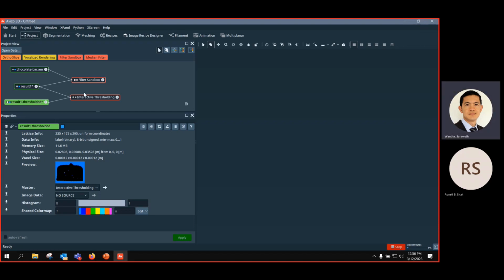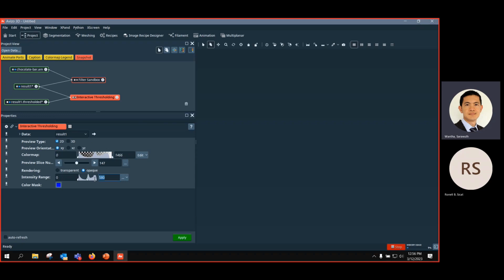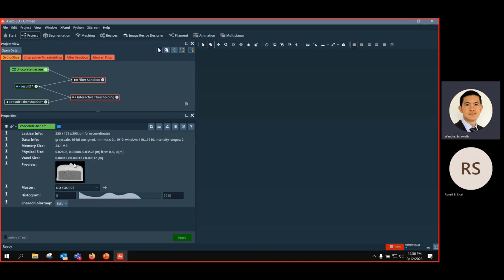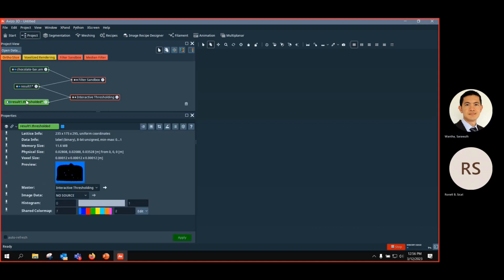Each pixel is from 0 to 580. It depends on your image, because here they don't have that intensity up to. Yes, exactly, one range of threshold.